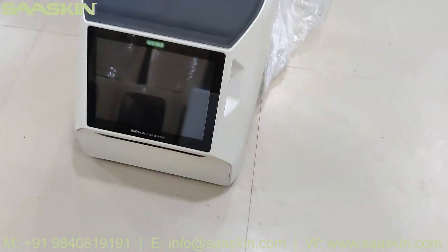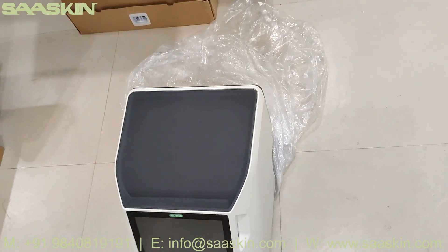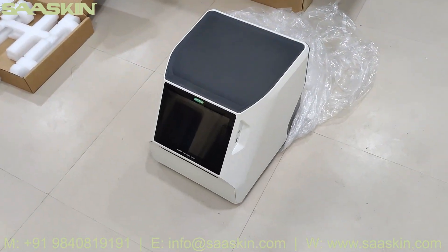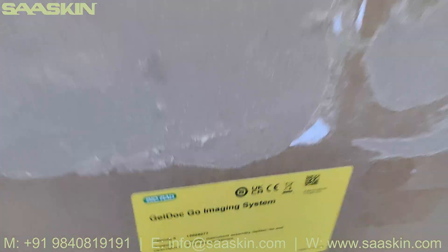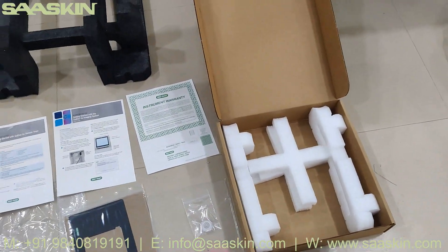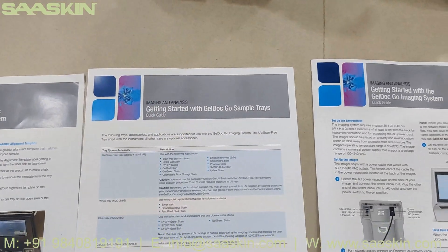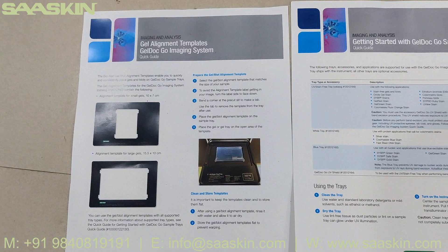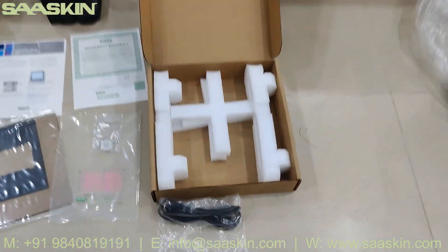This is how the total machine looks like. It says Bio-Rad GelDoc Go Imaging System. So just quickly to summarize: today we have seen the unboxing of Bio-Rad GelDoc Go Imaging System. You get one main machine unit and a small carton box with a complete set of accessories — instrument warranty, quick guide for getting started, quick guide for sample trays, gel alignment templates, a fixing plate, stickers, and the power cord.